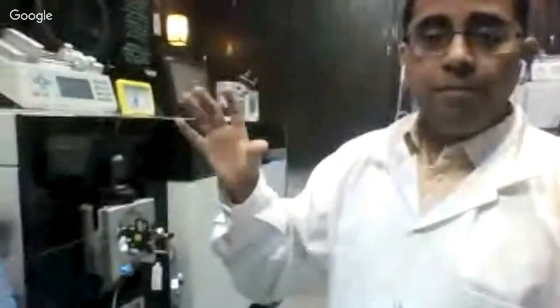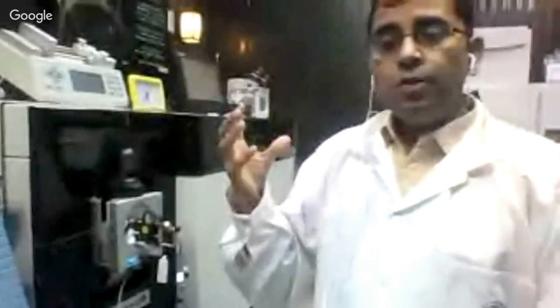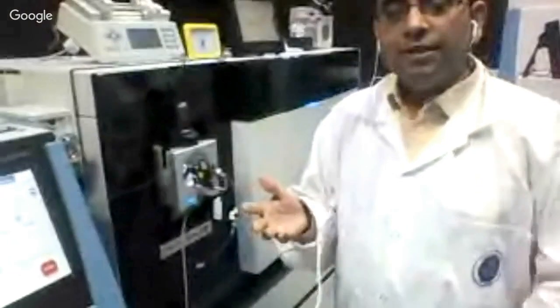I would say that for the time being, this gives you a perspective that mass spectrometry is a strong platform for doing proteomics. Of course, it's not everything. As we go along, you will appreciate that there are different types of technologies which can be used for doing proteomics work. But we just thought to start with this particular platform, which is very powerful for protein separation.